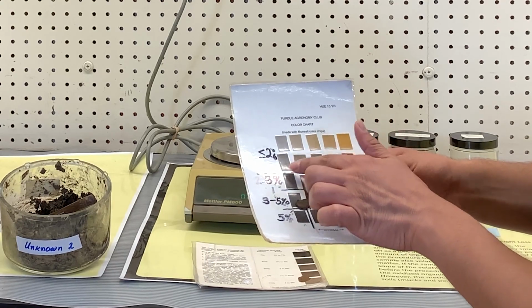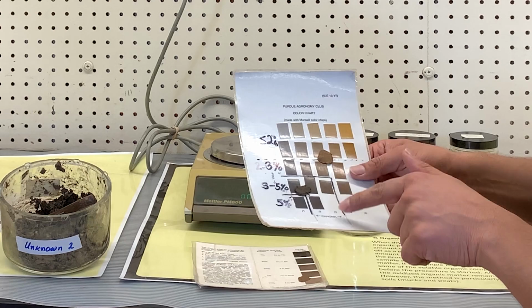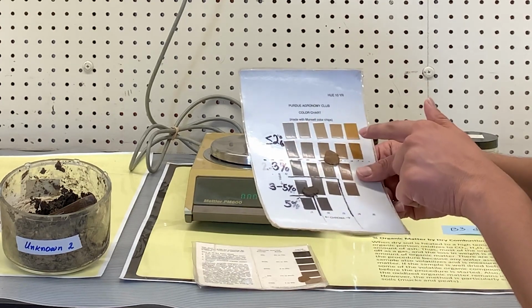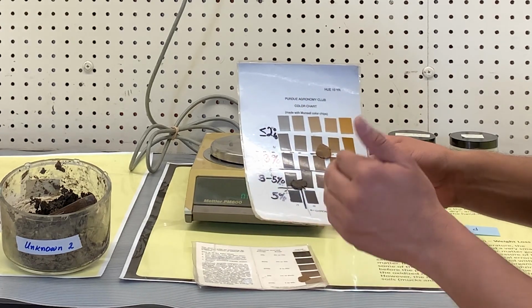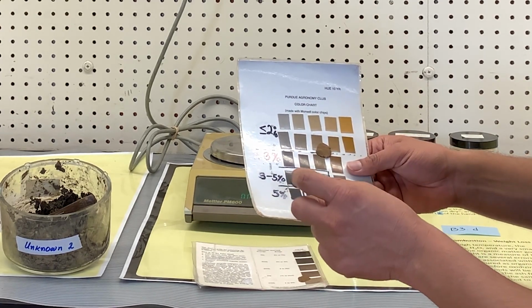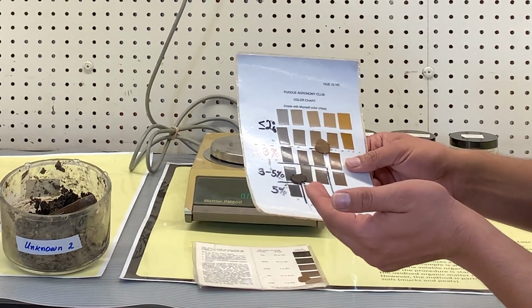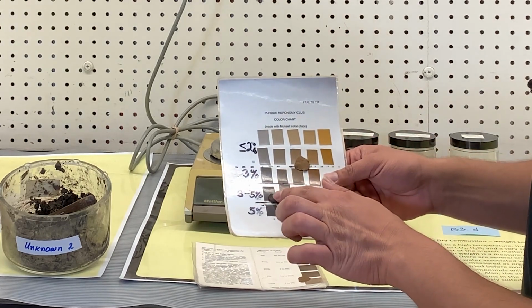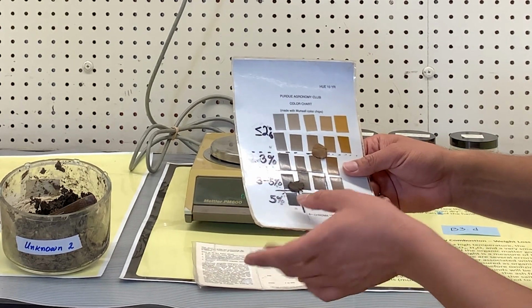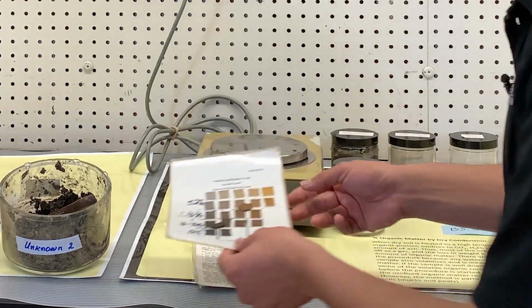place them, these colors are matching, like a 10YR 5/3 color, and that is less than 2% organic matter. And then as you go toward the lower values and lower chroma values, you get a darker color, so that represents more organic matter in the soil. Our unknown 2 has a 10YR 3/1 color, so that tells us that it has somewhere 3 to 5% organic matter.